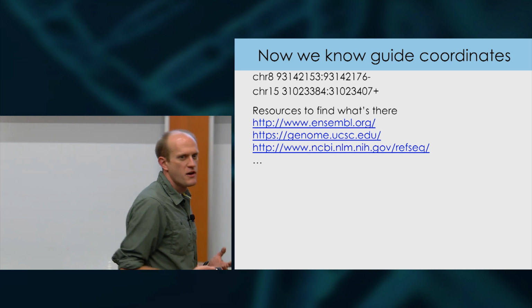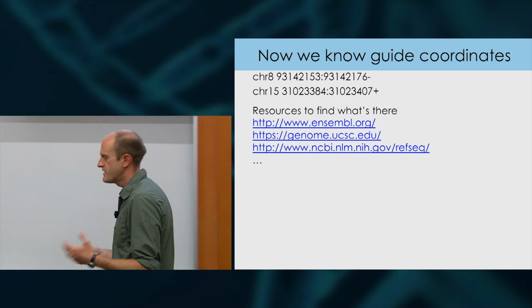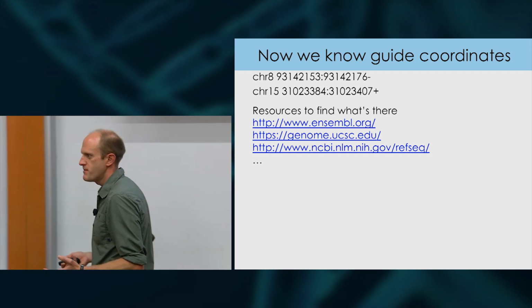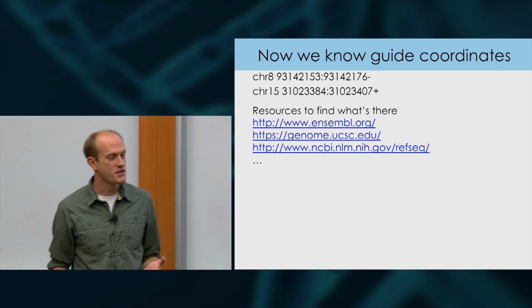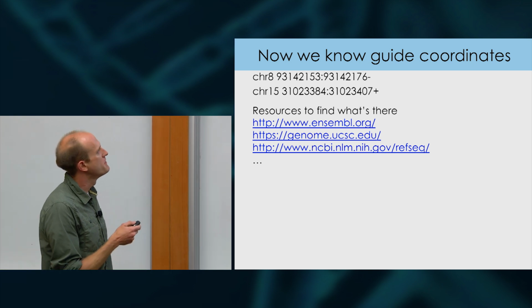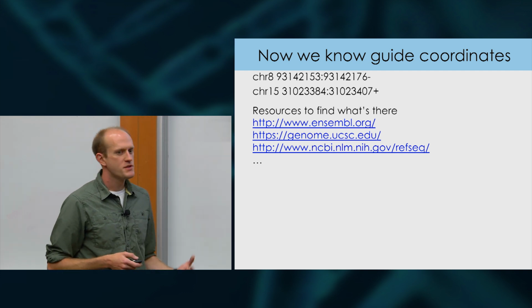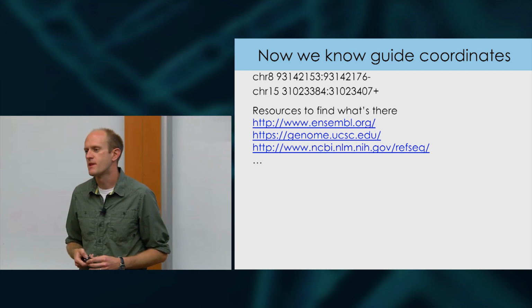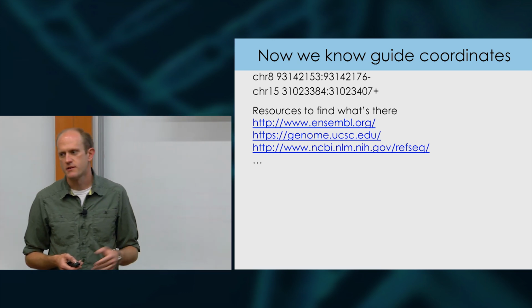And again, we live in the era of next-gen sequencing and ATAC-seq and DNA hypersensitivity mapping and all that stuff. So thankfully, we know a lot about what's in genomes. This is still an open question, and you should recognize that there are a lot of various tools out there, Ensembl, UCSC Genome Browser, but you always want to take what's there with a grain of salt.